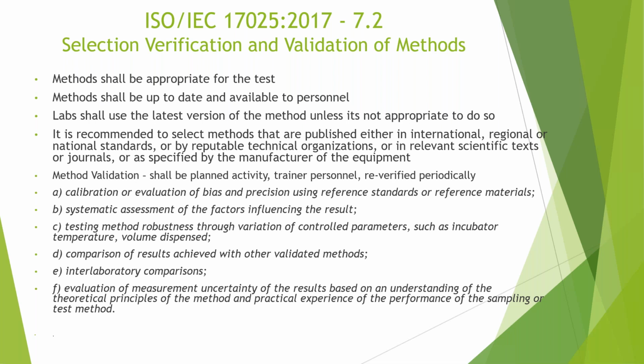We will expect all these things when laboratories develop their own in-house methods, regardless of whether laboratory A has purchased a technique from a particular manufacturer in the cannabis industry. You still have to take that responsibility, and you have to know what these systems do. You have to be educated, and you have to demonstrate that to us.